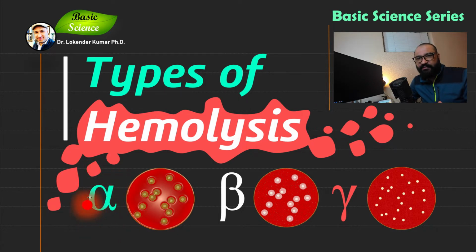That is why I have colored this alpha as green. So greenish to brownish color is the characteristic feature of alpha hemolysis. So if you have a bacteria on a blood agar plate, and surrounding that bacterial colony, you have greenish or brownish zone, that will indicate that you have alpha hemolysis.